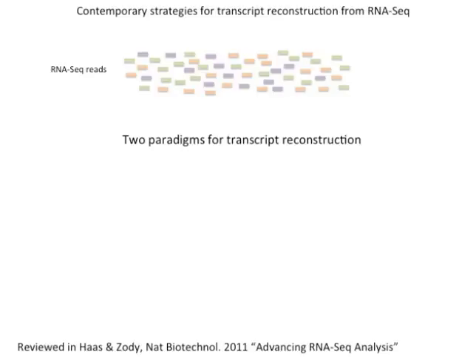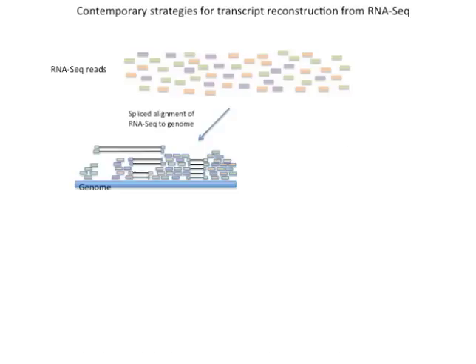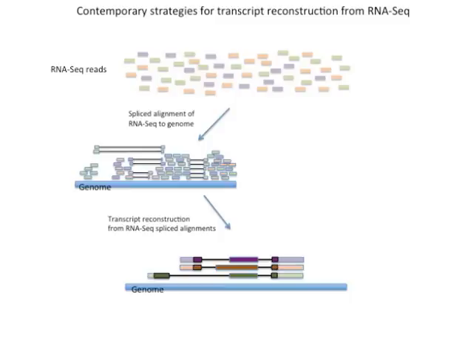One of the commonly performed tasks in RNA-Seq studies is to reconstruct the transcripts from which the short reads were derived. There are a couple of approaches to reconstructing transcripts from RNA-Seq data. In one approach, the reads are individually aligned to a reference genome sequence using a short read spliced alignment tool that can map reads across introns. Then, the short read alignments, instead of the reads themselves, are assembled into gene structures.